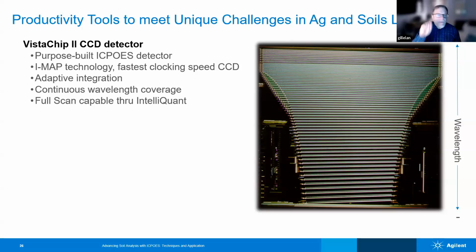This was a purpose-built detector. They're built so that light is incident on every single one of those. There is not a wasted pixel on there. Every bit of it is used, and it all collects light. So it all collects photons and then spits an electron out the back for every photon. Just like your digital camera works, or the digital camera in your phone, it works very much the same way. So that's what the Echelogram looks like.